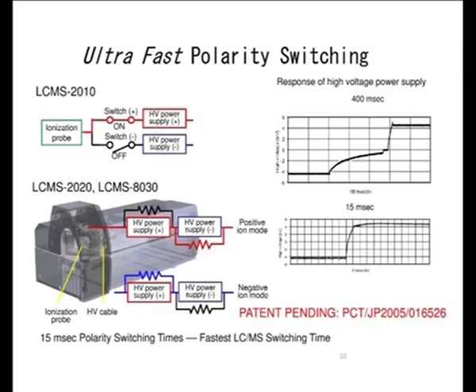Okay, therefore, you require the polarity switching time to be very fast, so that you can analyze both the positive and negative modes simultaneously, and you can detect the data.